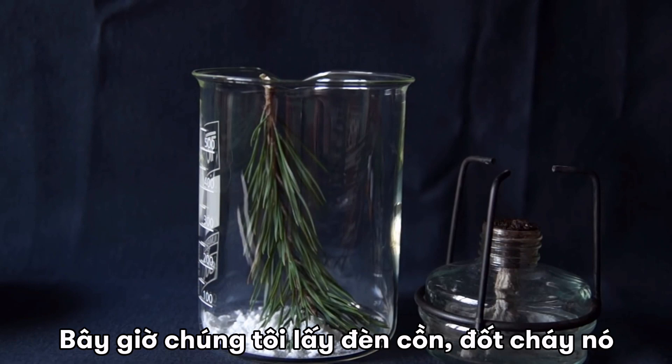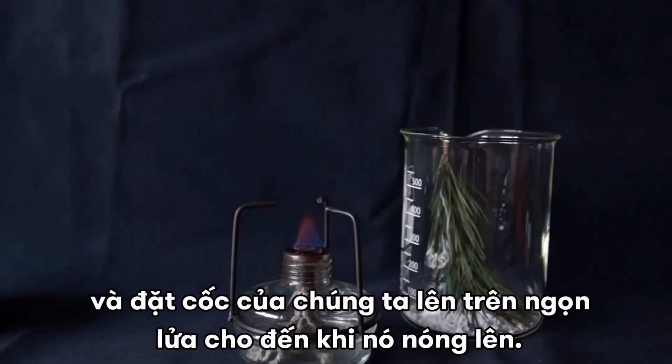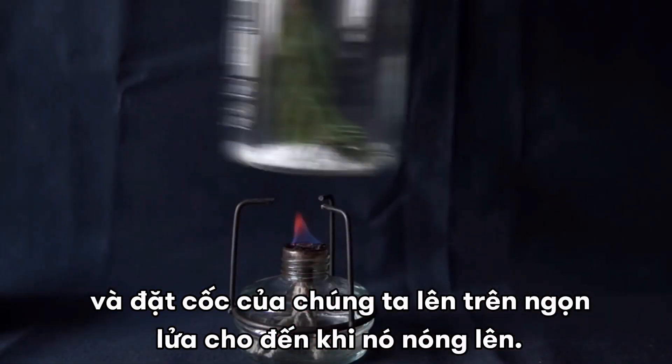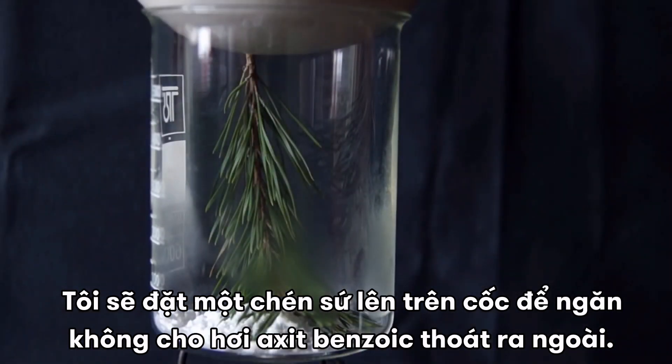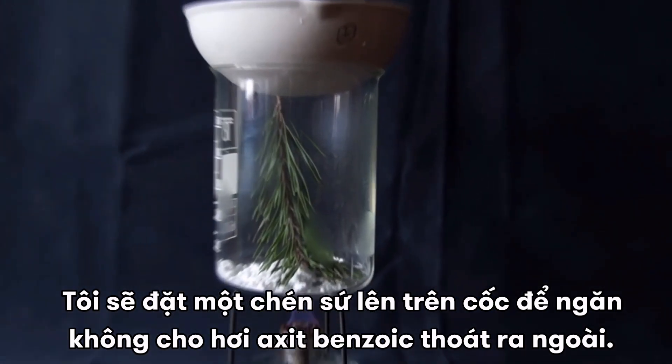Now we take a spirit lamp, ignite it and put our glass on top of it until it warms up. I have put the evaporating cup on top of the glass, so that benzoic acid fumes, which are formed in this reaction, won't escape.